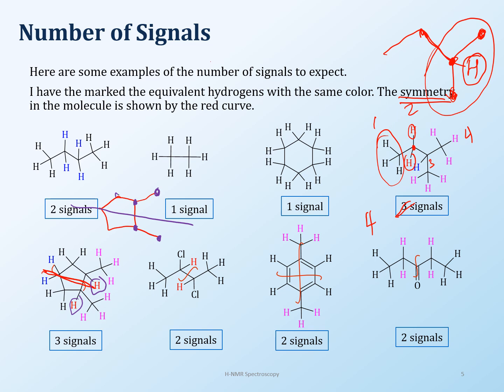And then these 2 protons will be the same. And then this is identical, 2 within itself. So 1, 2, 3, 4. So this is by itself. Those are the blue protons that you see here. Number 3, this is the same, these 2 are the same, and these 2. So you look at the symmetry line, and then from there on you can figure out how many signals you're going to see. So it's kind of messy, but I hope that helps you.